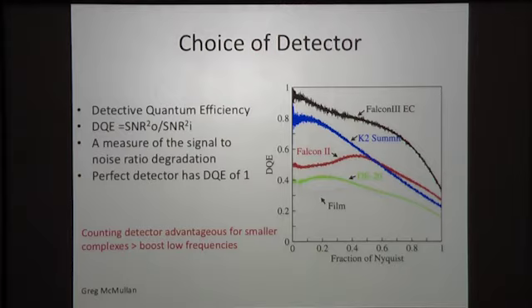Right. Before I talk about choice of microscope, I think we need to talk about detectors because the detector is almost as important as the microscope to some extent these days.